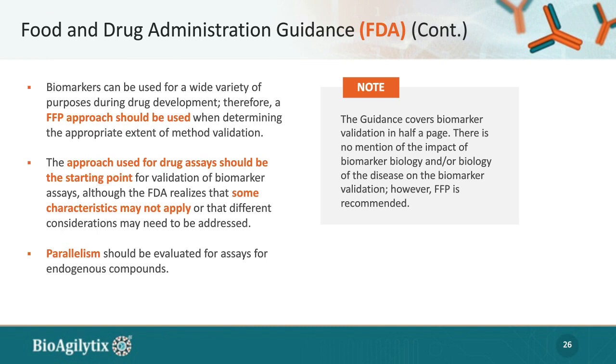I think one of the key points that they have included is the concept of parallelism, which a lot of us were very happy to see in the guidance. The guidance covered biomarker validation in less than a page. There are many things missing from this, but at the same time, I view this guidance more as a very 10,000-foot general approach, which is in line with what we're doing in the industry anyway.